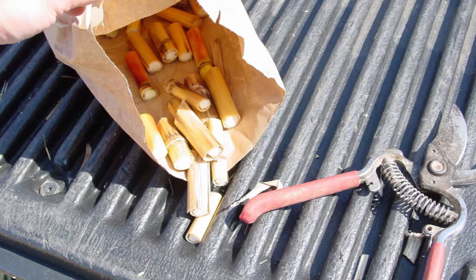Of the various tests that have been developed to manage nitrogen in corn production, the late season cornstalk nitrate test has been shown to be a useful and very reliable end-of-season indicator of crop nitrogen status. Done near the end of the growing season, it can serve as a report card, if you will, of the accuracy of the nitrogen rate that was used that year. This can then be used to make adjustments in the amount of nitrogen applied in the future.